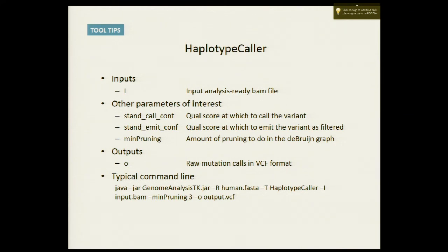Any other questions? When you have reads that are mapped to a couple of different locations, will it use those reads in the algorithm? It's only going to use the reads whose primary mapping is within the variable region. So I guess it would use half of the reads, if it has this algorithm of placing them randomly. Anything else?